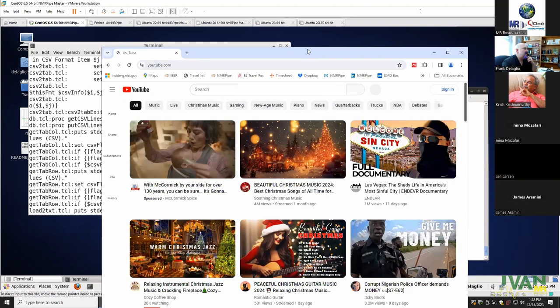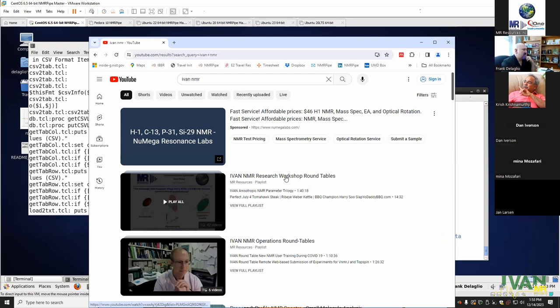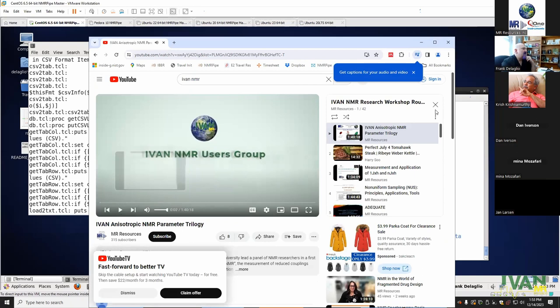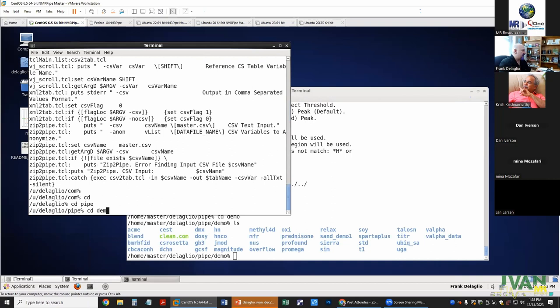Hi, Frank. I have what might be, I hope, a quick question. If someone is going to start a new project, is there a place where they should look to see what sort of general tools might be available in Pipe? That's a great question. I would suggest that the thing to do is download the demo data archive and just take a look at what's in there.